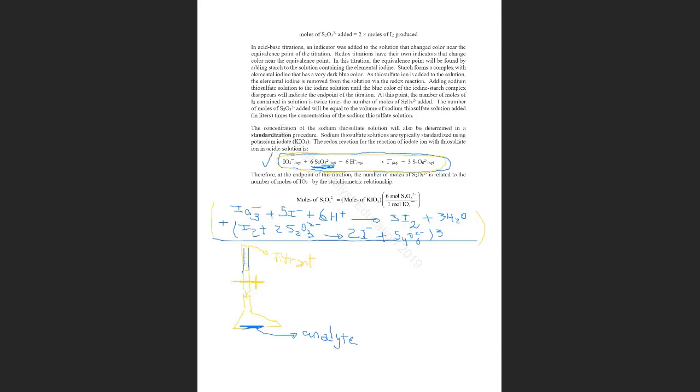Another simple question. Think that you are in the lab. Are you familiar with all the glassware you need for the titration? As I said 100 times, it is important, even though you are doing the experiment virtually, to understand how to manipulate the burette from the beginning, when you are conditioning and washing it, at the beginning of the titration, or closer to the end point.